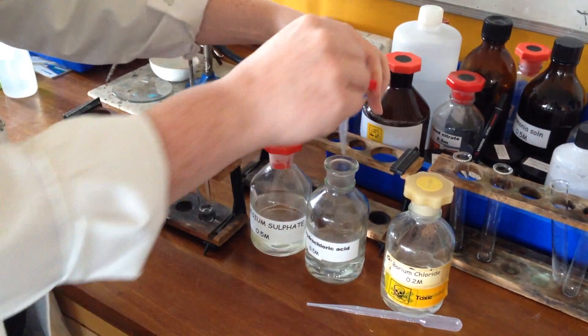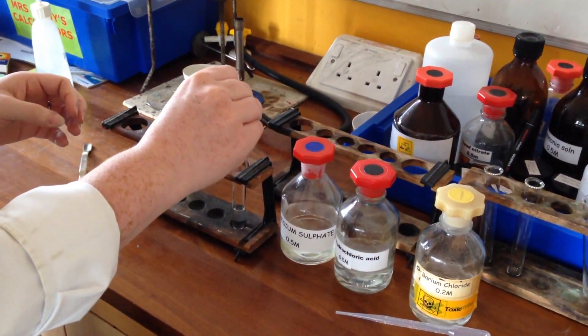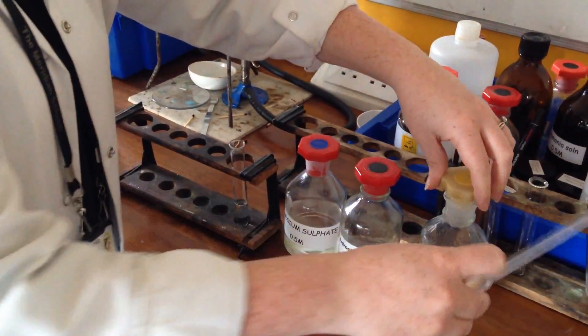I'm trying to get the amount equal. There's the hydrochloric acid — nothing has happened. We should see something happen when you add in the barium chloride.